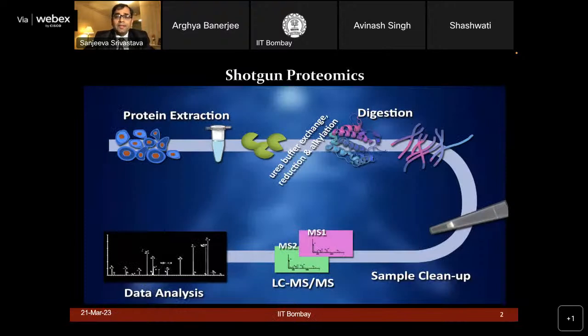So, as you have studied in these courses, proteomics started with the conventional two-dimensional gel electrophoresis, or gel-based proteomics. That was a very simple and important technique which helps scientists investigate the proteome at a simplified level, not the very deep and complex proteome, but looking at maybe a few hundred to a thousand spots or proteins that could be analyzed.